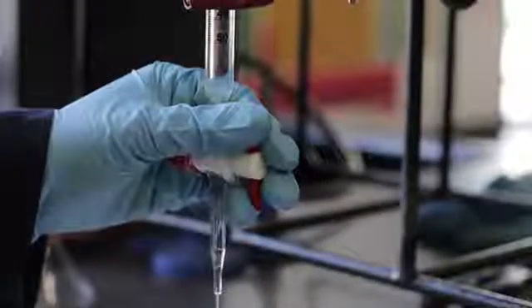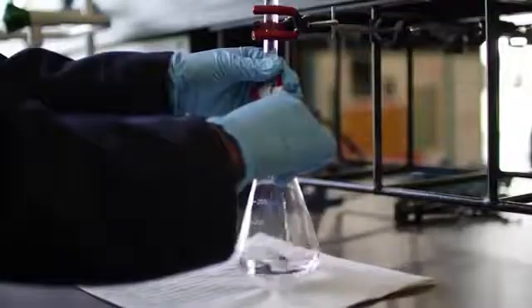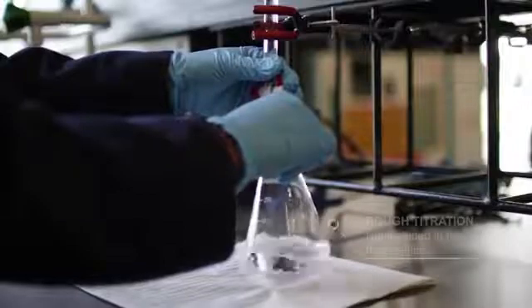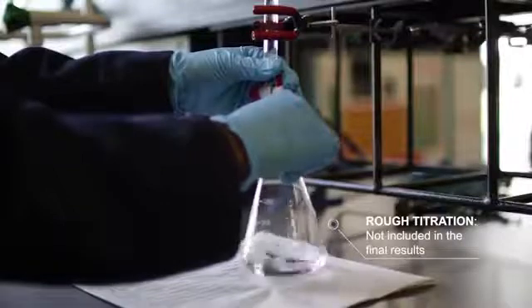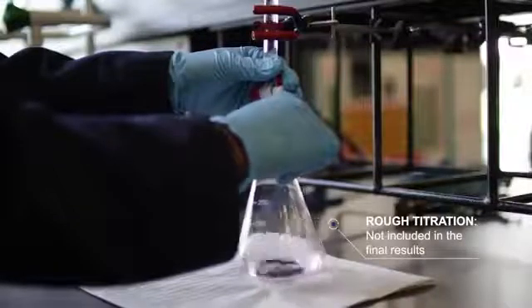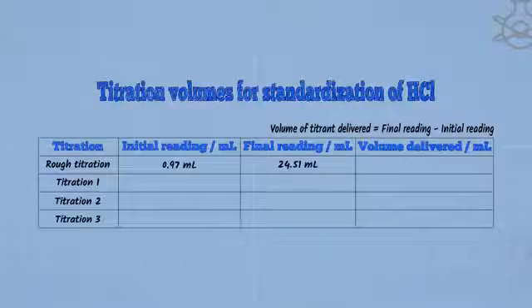When performing the first titration, the solution is delivered at a rapid pace to get a rough idea what volume is needed to reach the endpoint. This is known as a rough titration, and it is not included in your final results as it is not accurate. However, you still need to record the final volume reading from the burette. The volume of solution delivered is determined by subtracting the final reading with the initial reading.